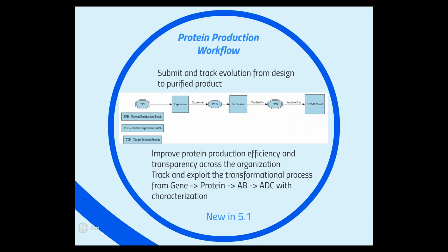Of course, we want to be able to track and exploit the transformational process right from maybe the initial gene through to the expressed protein, through to the antibody and into the antibody drug conjugate, and collect alongside all that information also the characterization data that's important to give people that information and know that it's readily available to look at the lineage right back from the final antibody drug conjugate through its lineage back to the original genes.